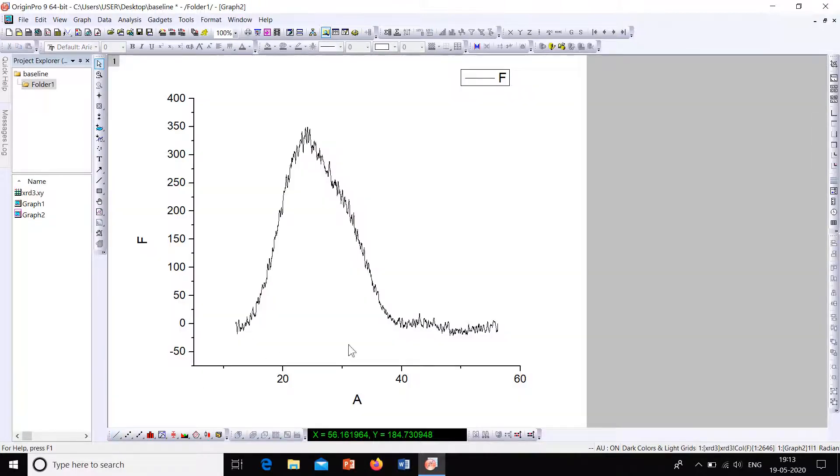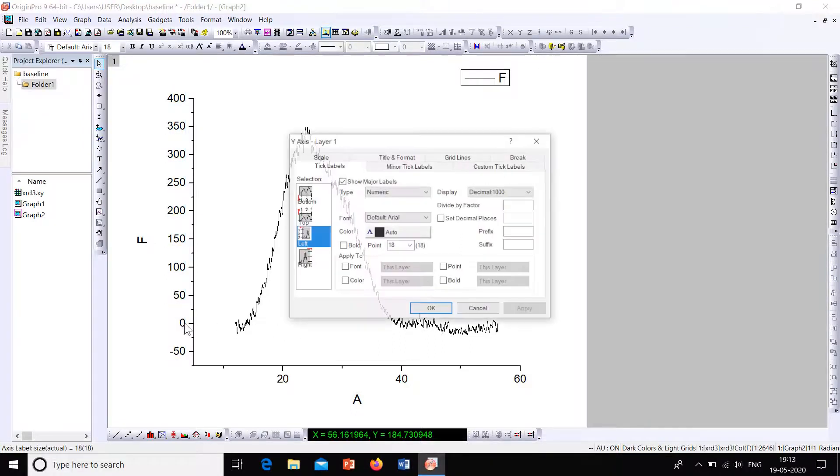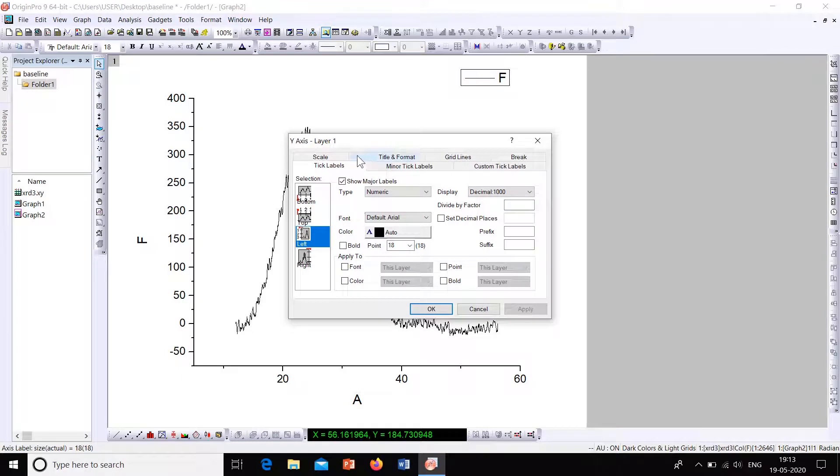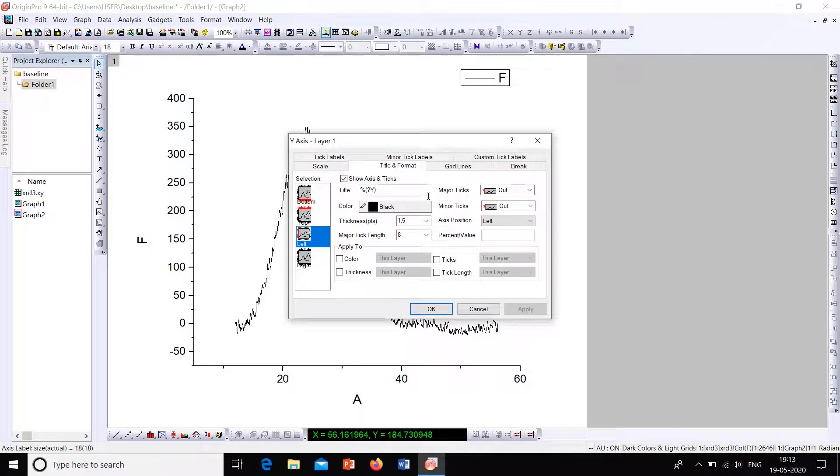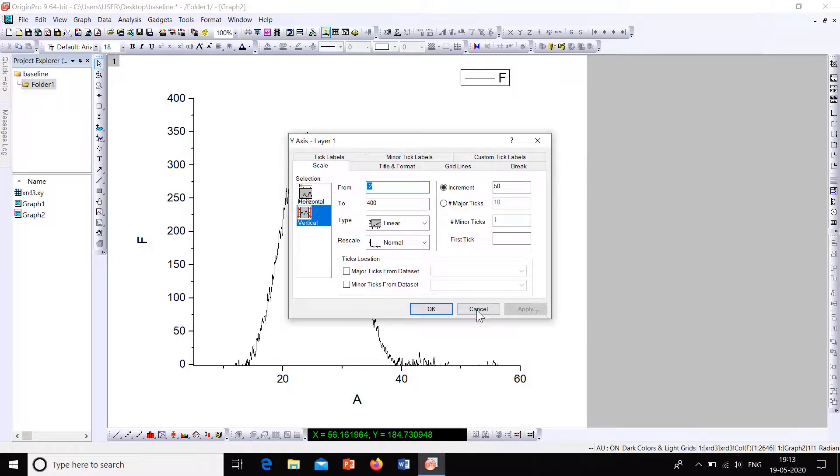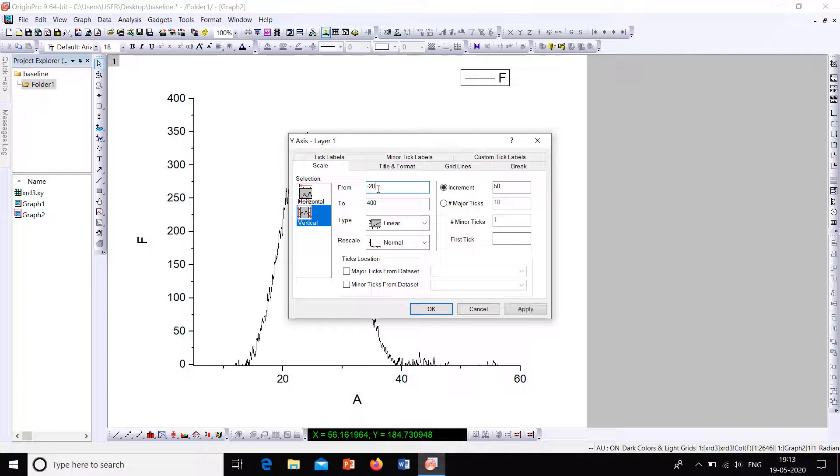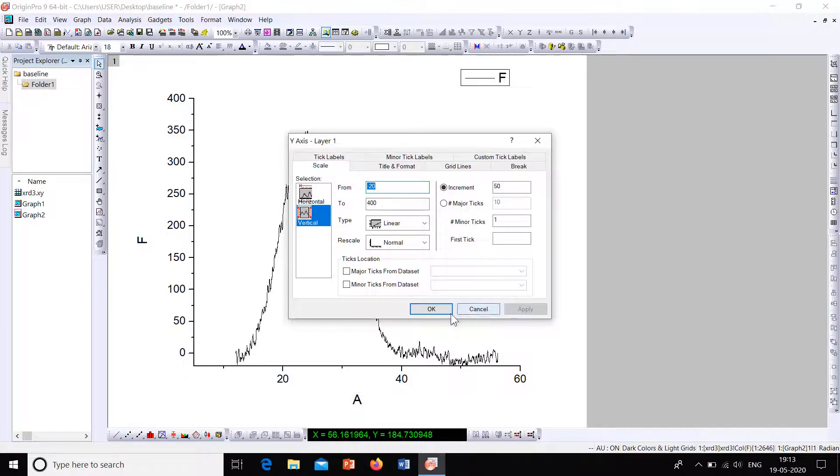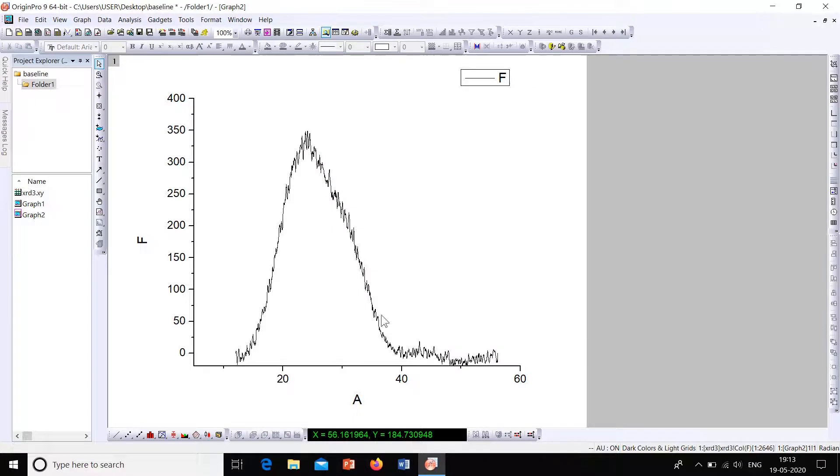Now we can see that the graph is baseline corrected. For better understanding, let's change the scale. We can start it from, say, minus 2. Now click onto Apply. So this is a baseline corrected curve.